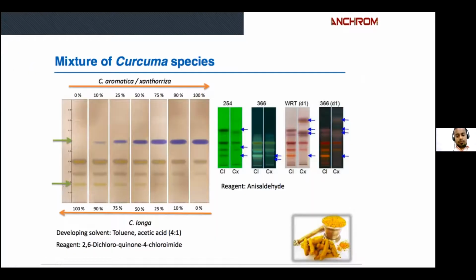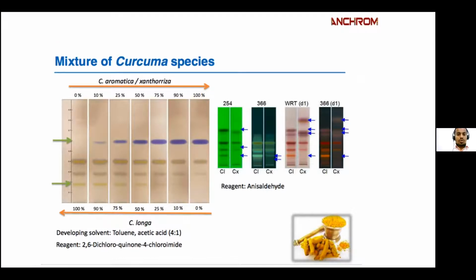Next, one of the best example of this fingerprint, by using this fingerprint, you can say whether curcuma aromatica is added to curcuma longa or curcuma longa is added to curcuma aromatica.